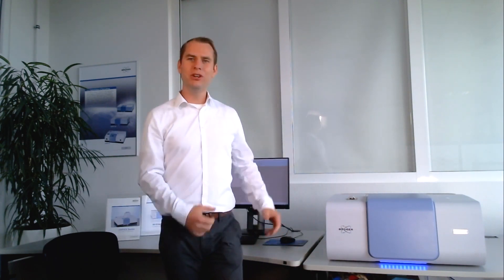Welcome to our demo rooms here in Ettlingen. In the next few minutes I will show you a live demonstration of our Invenio X. I will perform a multi-spectral range measurement. We have a sample — this red packaging foil — and we will measure it with our multiple spectral range function from the far infrared over the mid-infrared up to the UV range.